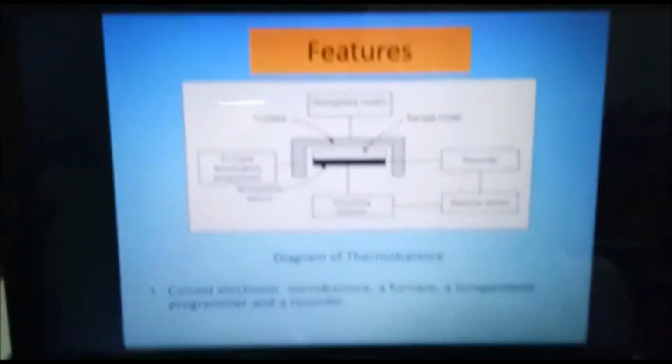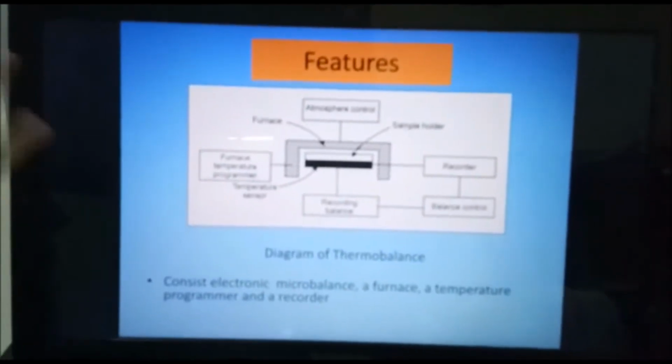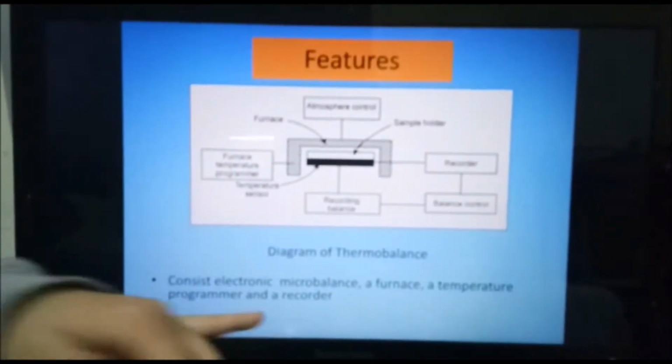Thermal-Gravimetric Analysis. Today I would like to talk about the features. Firstly, as you can see, this is a diagram of the thermobalance. The thermobalance consists of an electronic microbalance, a furnace, a temperature programmer, and a recorder.